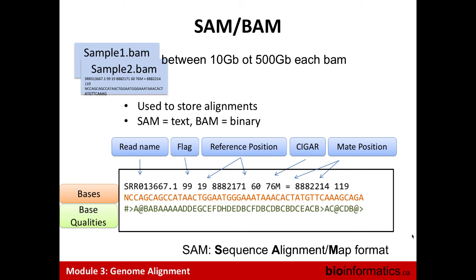So what's the scale for that? For the CIGAR string? What do you mean by the scale? Like, what's the worst score you can get and the best? It's not a score, it's just a description. As you say here, this could be a CIGAR string telling you my sequence is 4 matches, 1 deletion, 2 matches.